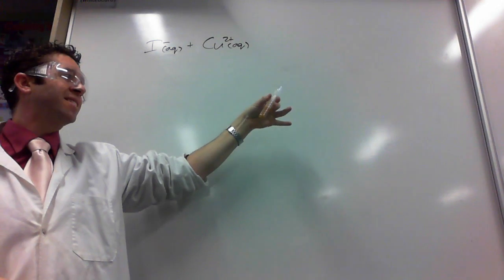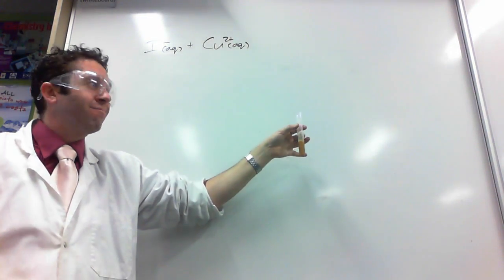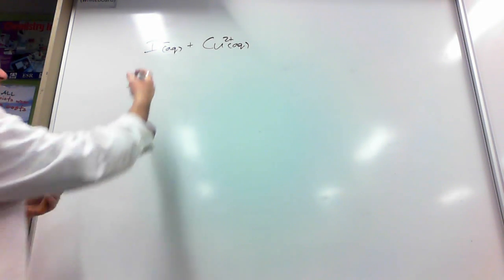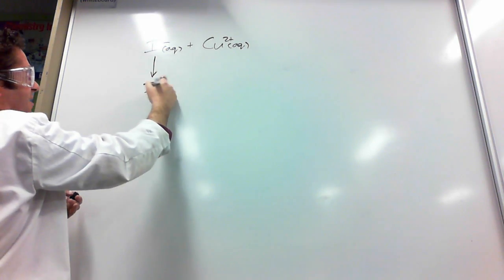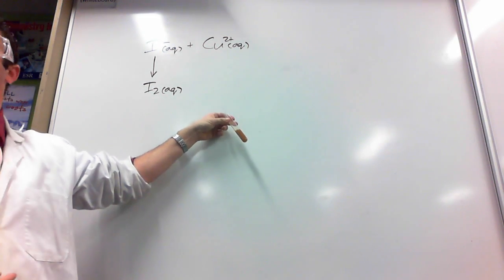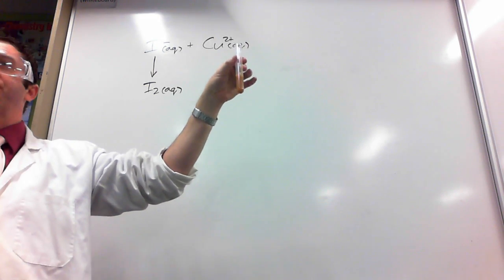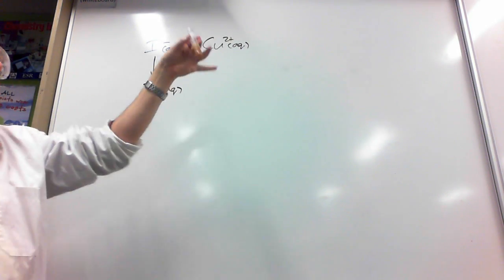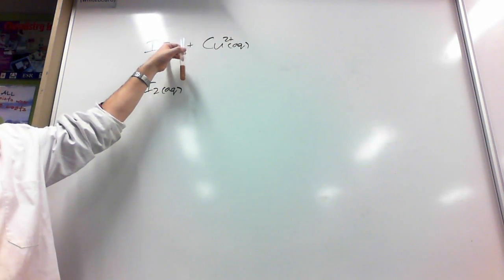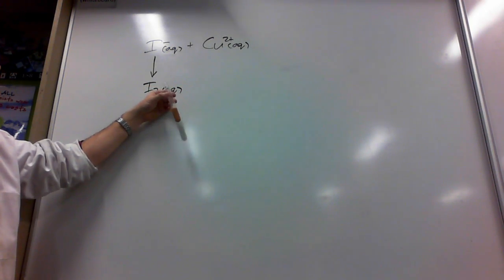Now, it's hard to tell what colour the precipitate is because it's gone this murky brown colour. And I don't know exactly what's happening until I look at my reagents. Iodide generally becomes iodine, which is a browny, yellowy colour. So I could infer that that's probably iodine. But it's masking anything else that might be in there. It might actually be a brown solution, because iodine probably can dissolve if I've got lots of iodide present. And I do, because I put lots in to start with. So I'm sort of, okay, not sure.